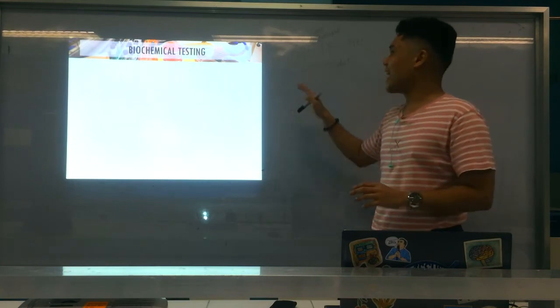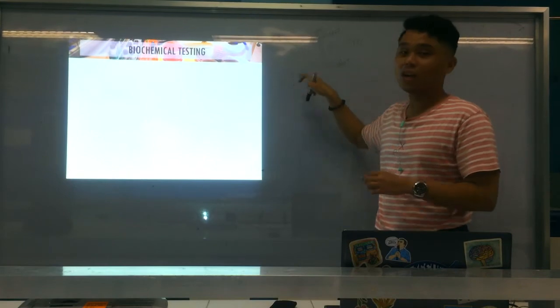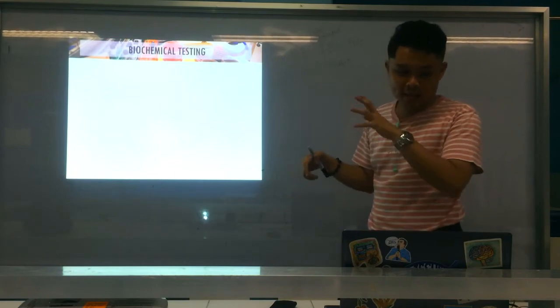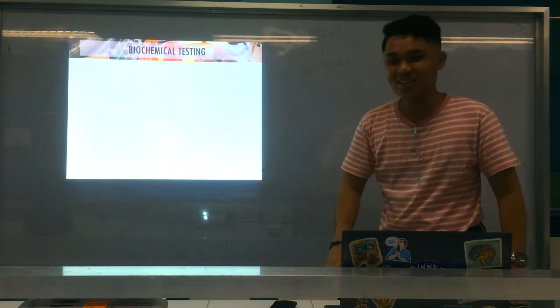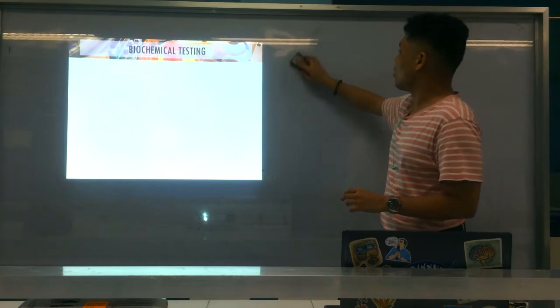Okay. Again, slide coagulase, it detects your cell-bound coagulase or clumping factor. Don't forget clumping factor. And your tube coagulase, it detects your free coagulase. So SB, TF, Starbucks tayo friend or Starbucks tapos okay, alright. Ayan, so that's for your true coagulase, Staphylococcus aureus, and coagulase test.